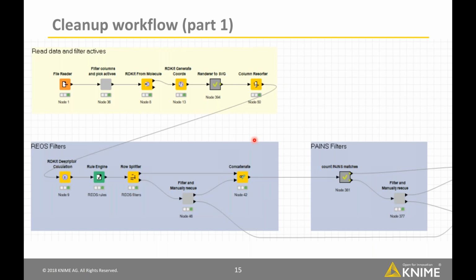This is what the workflow looks like for the cleanup. It's fairly complicated, so I broke it into 2 parts so you wouldn't be able to see anything. We're going to walk through this. I'm going to do a slide demo. I'm not actually going to open up Knime and do that. I'm not brave enough, I'm afraid, to really try and do a live demo via WebEx. But so we'll go through each of the nodes.